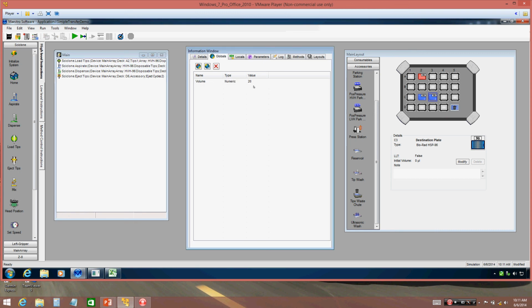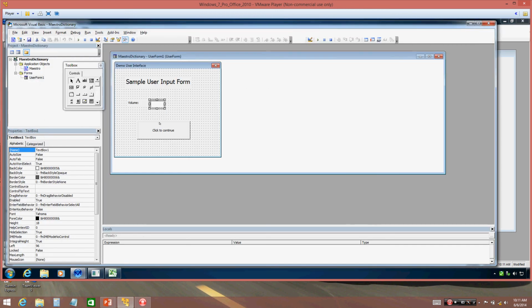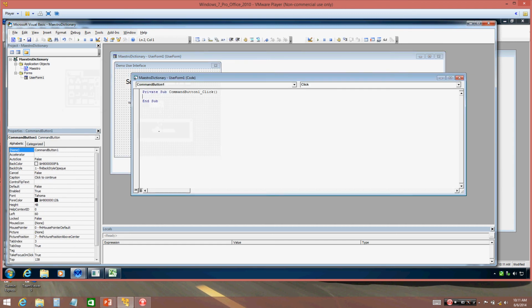This box that's selected over here, when I click on it, it says text box 1. So when I double click this code over here, there's actually one line that you really need to write. There's nothing too special about it. I've had a lot of users honestly surprise me and create these amazing interfaces. So here I'm going to type Maestro, and when I hit a period, there's something called IntelliSense.